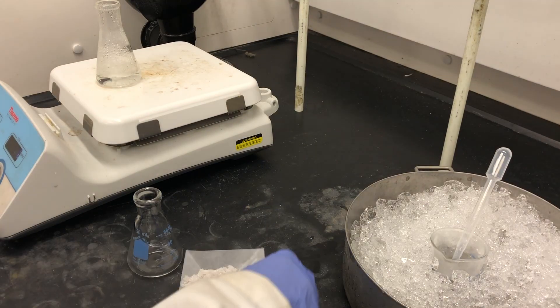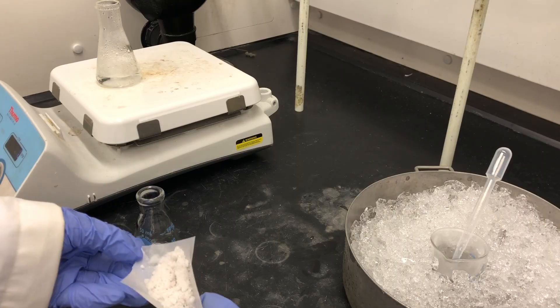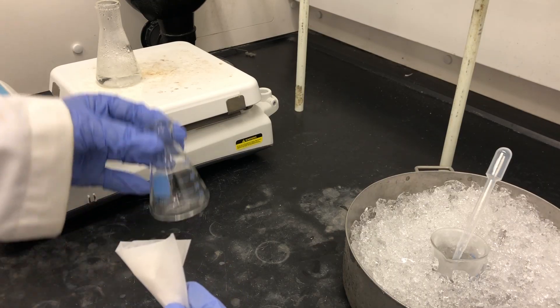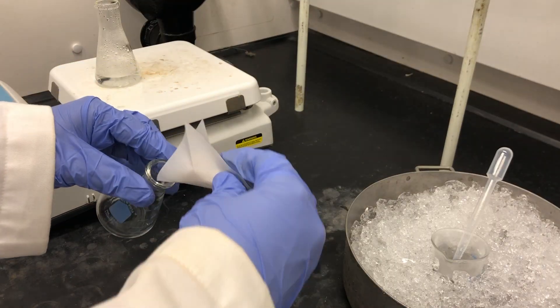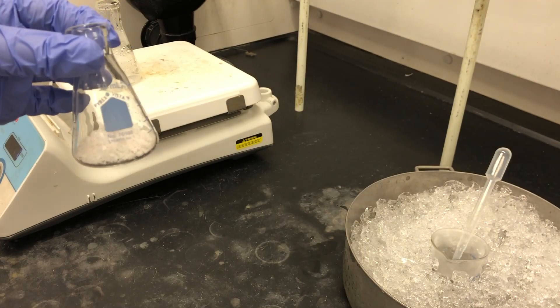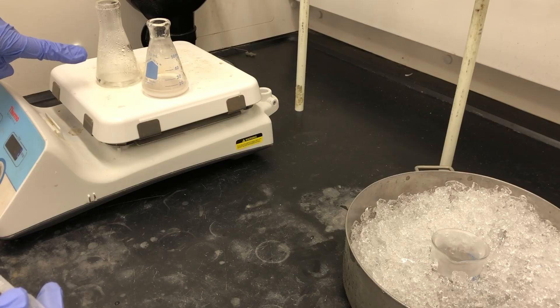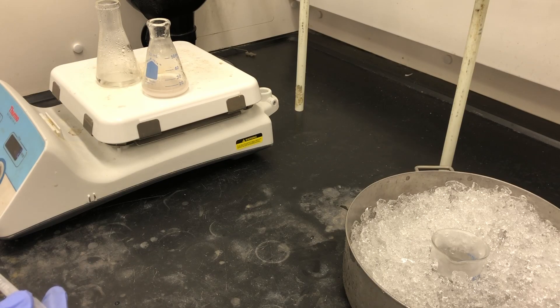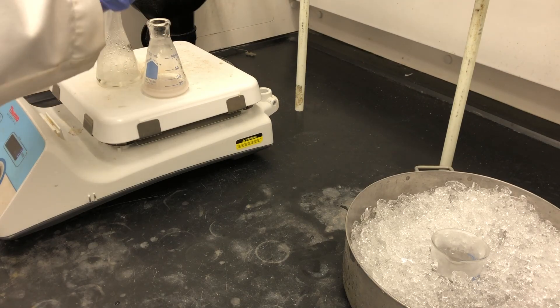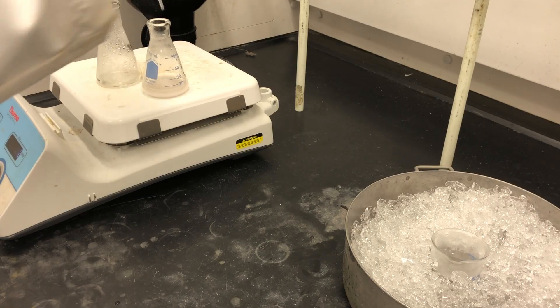Now it's time to recrystallize the crude product. We'll take the crude product and place it in a 50-milliliter Erlenmeyer flask. We're going to use a minimum amount of hot recrystallization solvent. It'll take about 3 milliliters of the recrystallization solvent per 1 gram of the crude product for this specific experiment, but it could vary slightly, so it's important to keep that in mind.